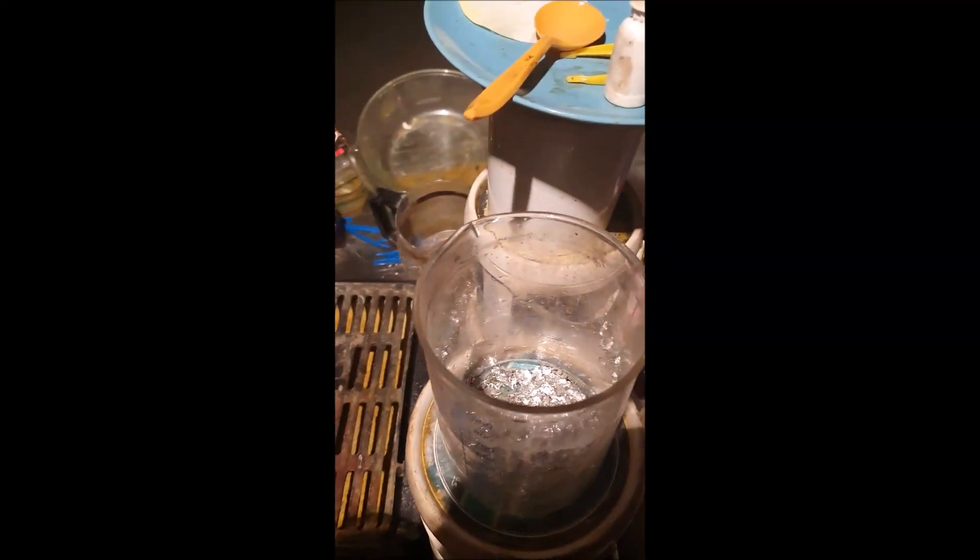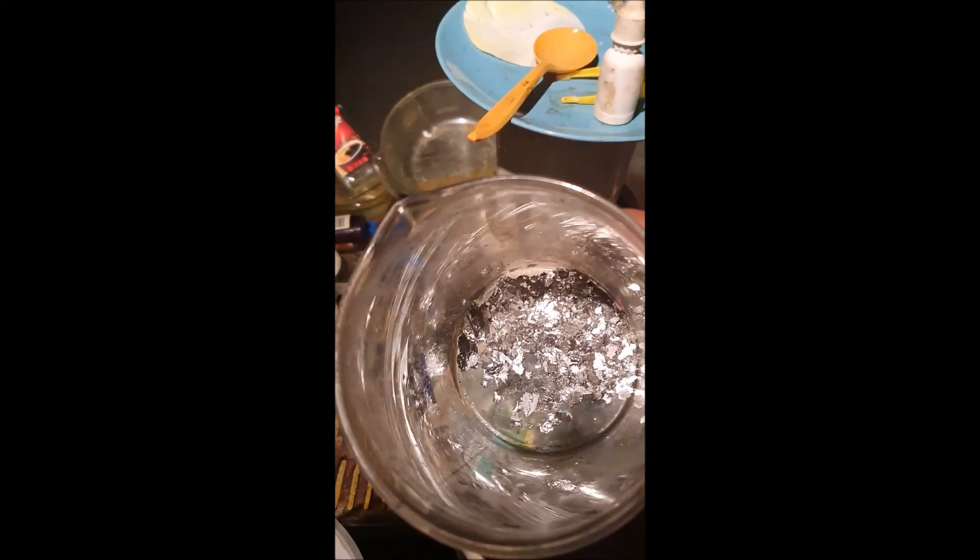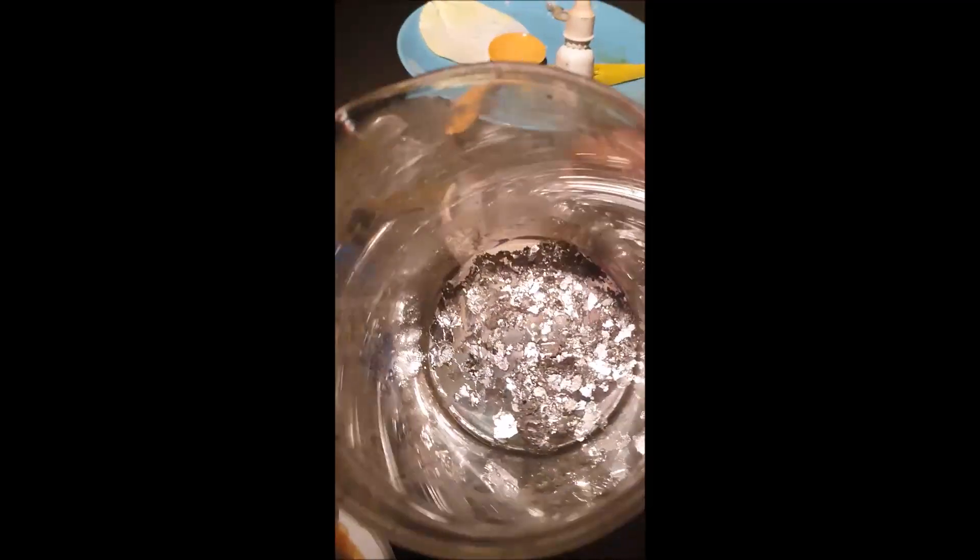G'day viewers, Prospector Pete here. This is just a quick video to show you how I make stannous chloride. This is only solder from when I heat up circuit boards to take everything off — I collect all the solder. There might be lead in there but it still works for stannous chloride.